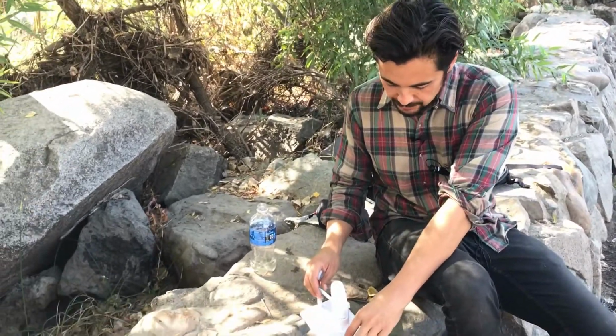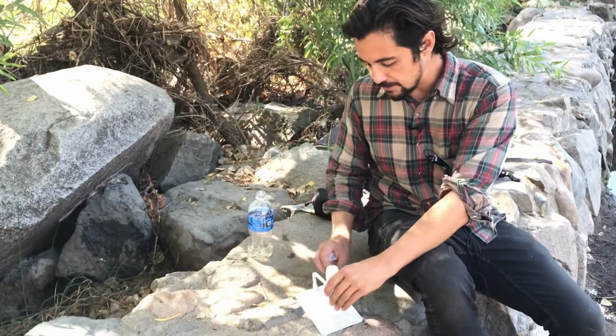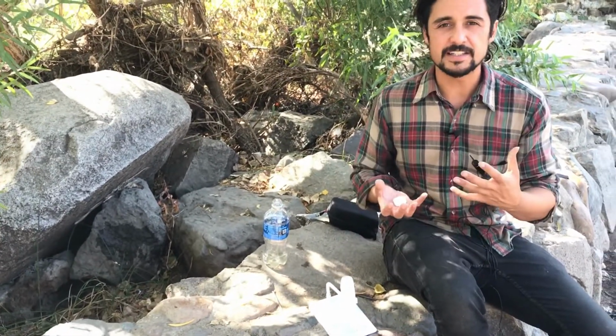Now that I have that tray ready to go, I'm going to put that under my digital microscope. And now I'm going to start looking around and seeing if I can't find some kind of microorganism. Once you find something, try to identify it. And the microorganism that's the smallest and most confidently identified is the one that you're going to want to share.